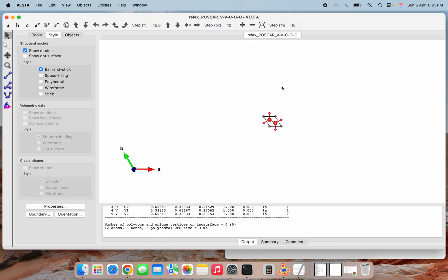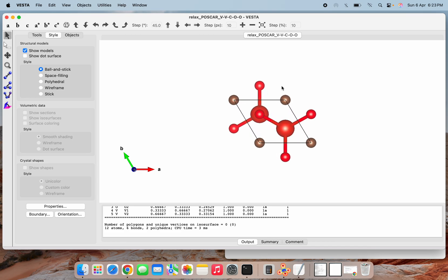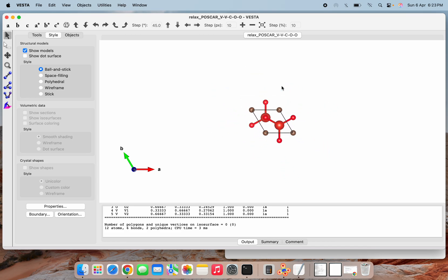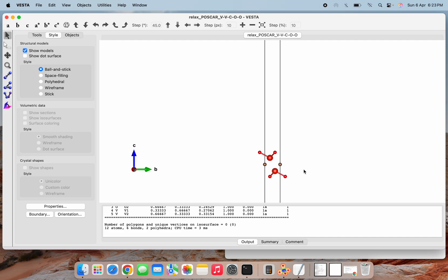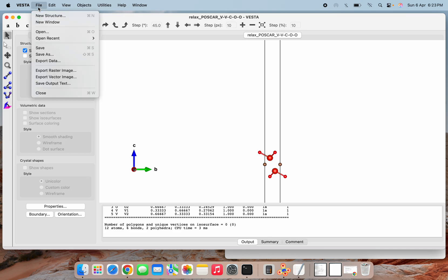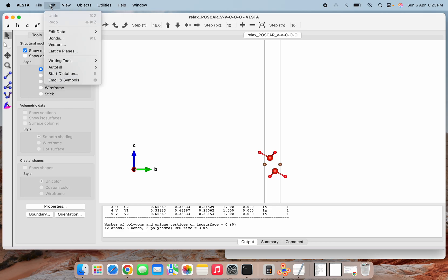As you can see, this is the V2CO2 unit cell. If I show you from a different angle it looks like this. The big red color atoms are vanadium, these are oxygen, and these are carbons.